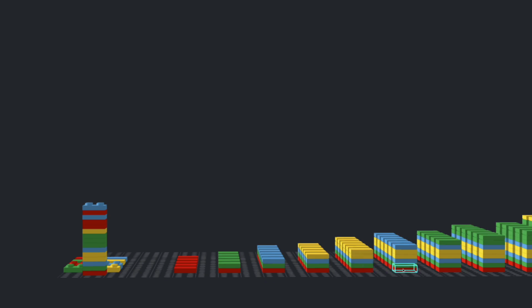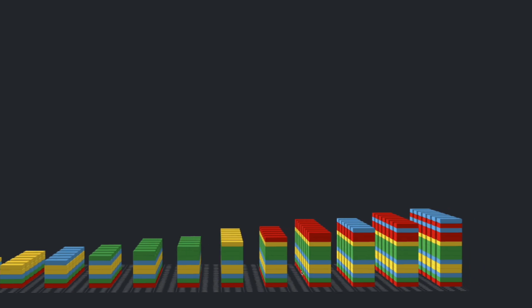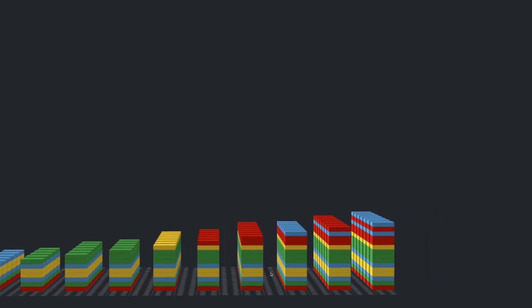And so for the one-piece block, we get a red fluorescence. The two-piece block, we get a green fluorescence, then a blue, then a yellow, and that is how we're able to tell the sequence of the DNA with Sanger sequencing.